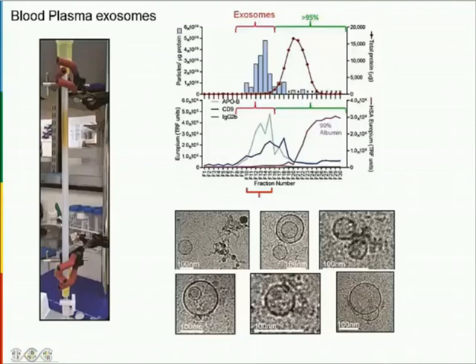So this was an example of cryo-electron microscopy, and often by cryo-EM, and you don't really see this by traditional TEM, by cryo you do see often membranes within membranes within membranes. And there's a little Death Star type of structure here, which is my favorite. Again, this gives you really good structural information that you perhaps would not know about using traditional approaches, and the column method is a really good one-step approach for cleaning this huge burden of protein which is present in plasma and facilitates further downstream analysis by mass spec or some other omics analysis.